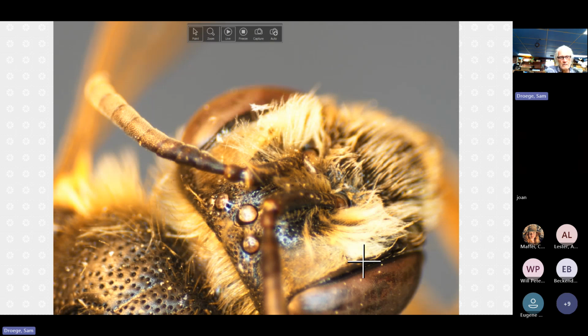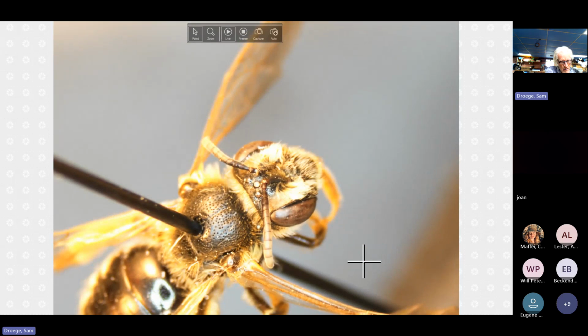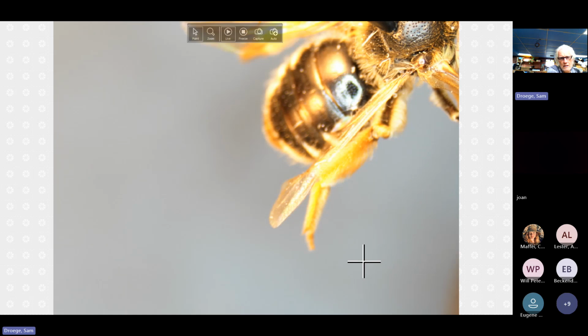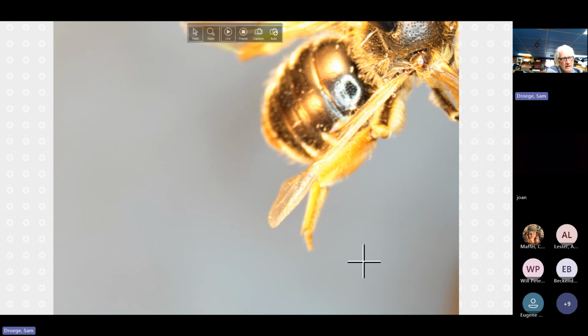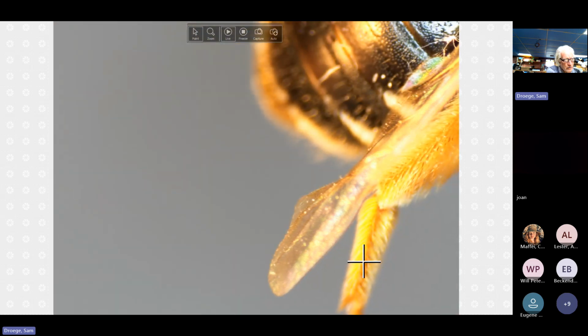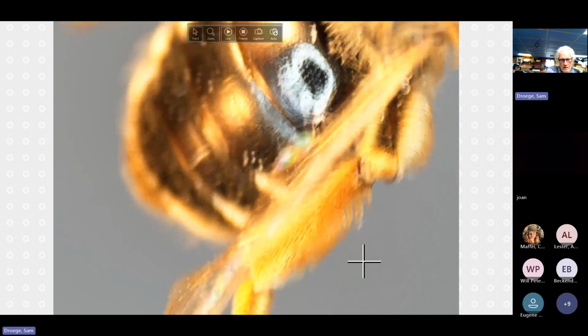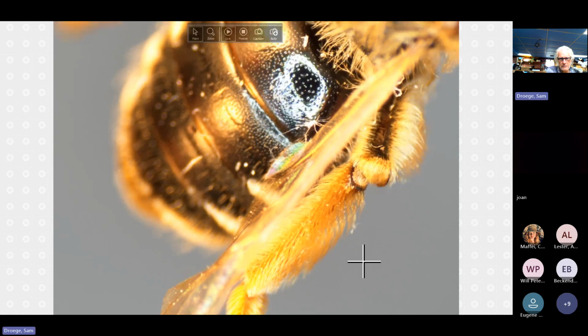So now the super nice to have character on this species are the orange legs, and you can see them right from here. And it's not a subtle character. It is orange. And we'll look at it maybe from the side too. The tarsal segments, including the basotarsus, which the X is on right now, and the tibia are just plain old orange. And the hairs are light. They're not really orange, but the integument is orange. And so that shows up nicely.